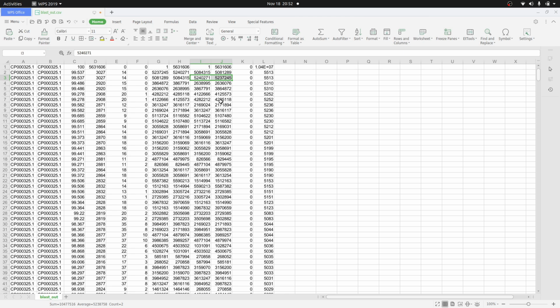So that is where the visualization comes in. If you have it like this, it's going to be difficult to identify patterns. So this is where the visualization comes in. We are going to extract some information from here and then use that to generate our Circos visualization. That's what we are going to do.